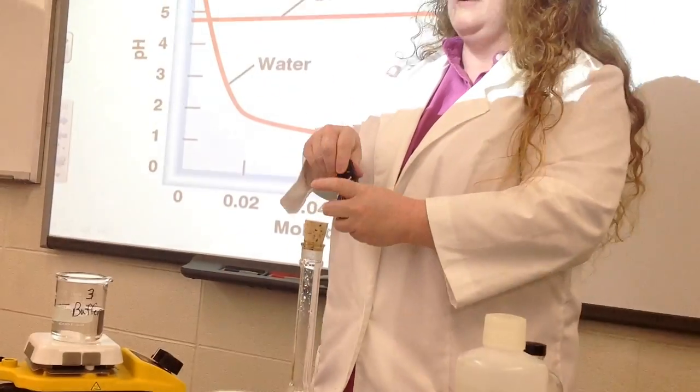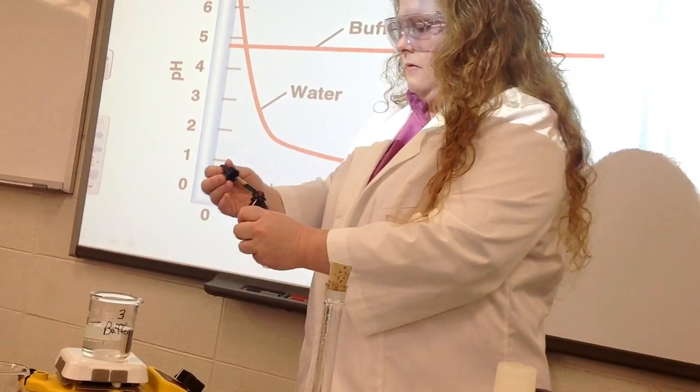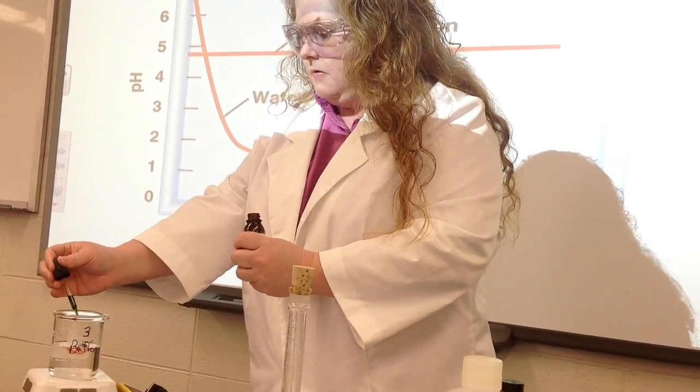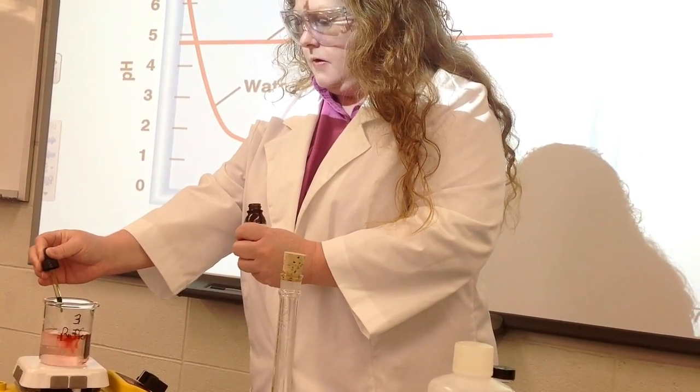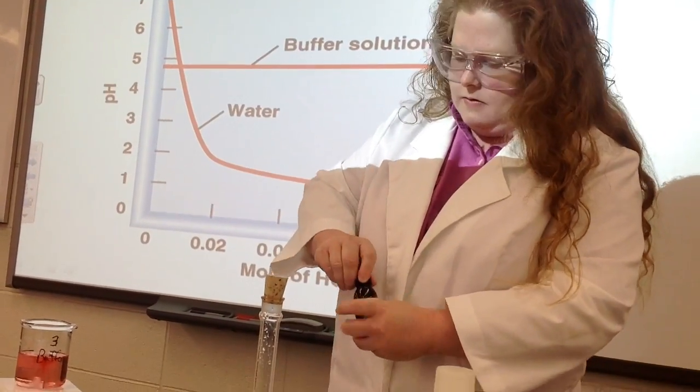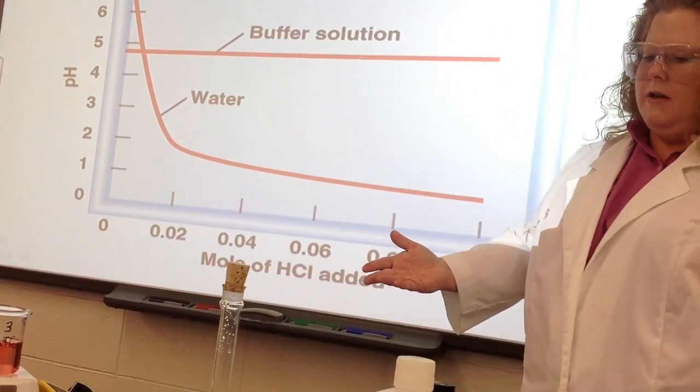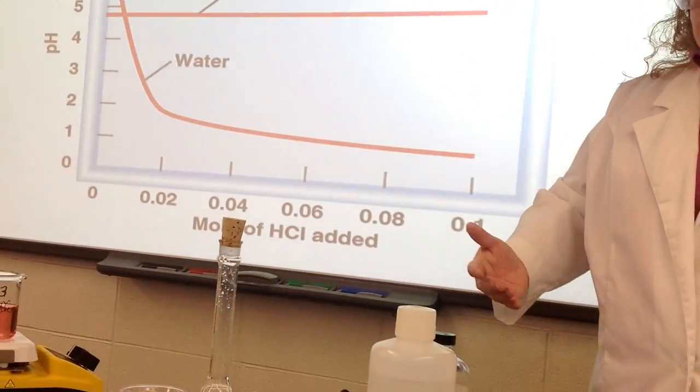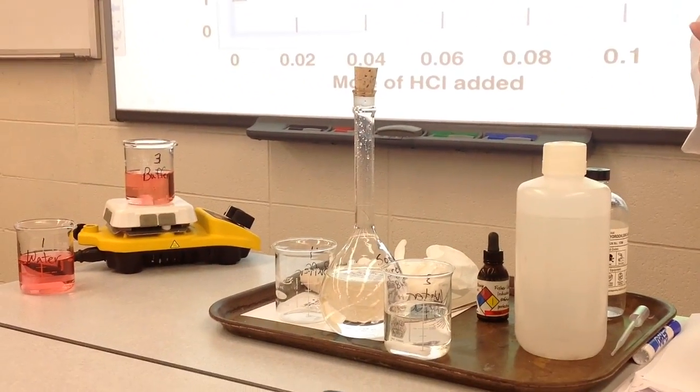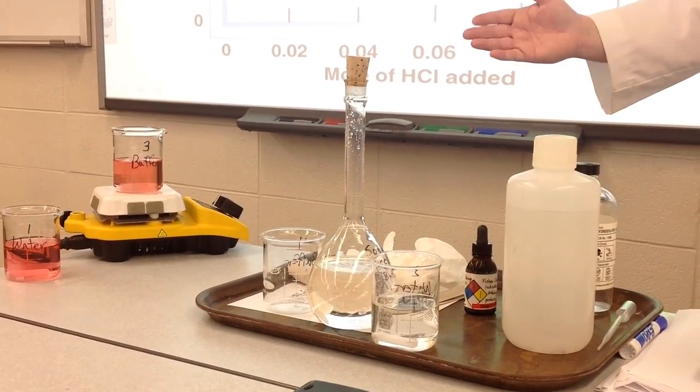So of course first I do want to add my indicator. Indicator now, it may start out a little bit different. So obviously this buffer was a little bit more acidic than the distilled water that I had.